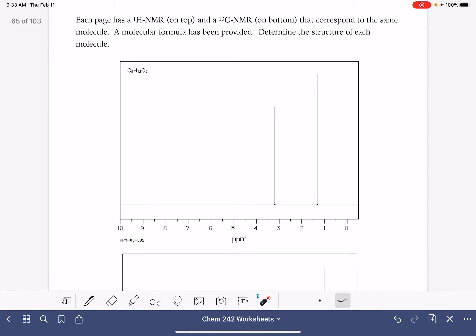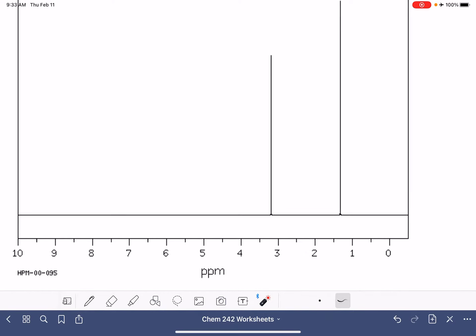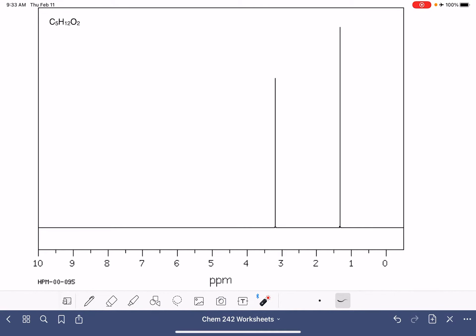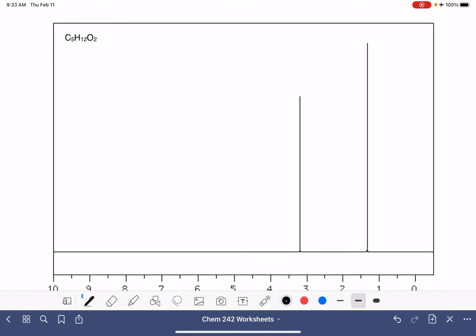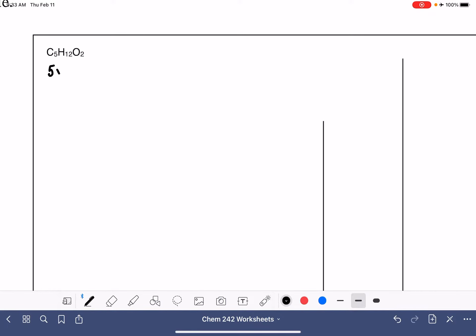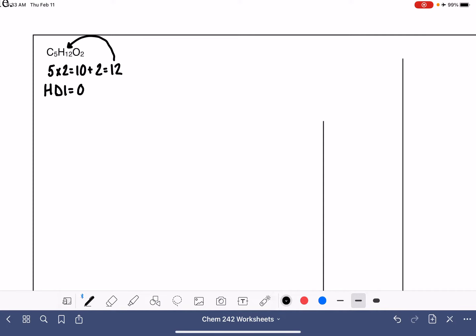This first molecule is actually really tricky because there is no information on these peaks — no integrals or anything, just a couple of peaks, so it's going to be difficult to figure out. Let's start by calculating the HDI from the molecular formula. We have 5 carbon atoms: 5 times 2 is 10, plus 2 is a maximum of 12 hydrogen atoms, and that's exactly how many we have. So this molecule has an HDI of 0, which means no double bonds, no rings.